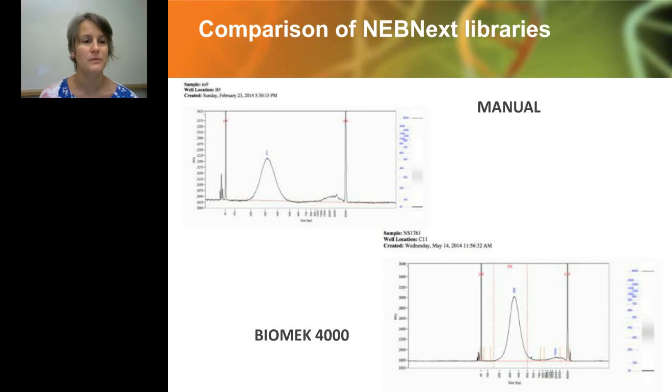So here I'm showing a comparison of 2 libraries generated with the NEBNext protocol on the Beckman, the Biomek 4000. The top panel is a manually prepared library and the bottom panel is the Beckman prepared library. What you can see is that the software for the Fragment Analyzer is different in these two cases.